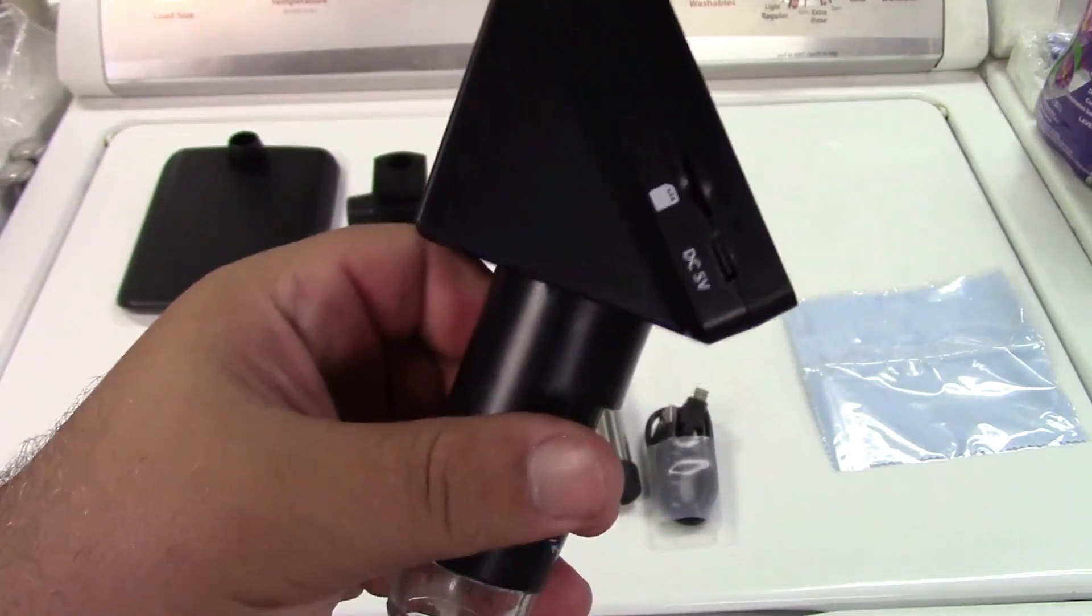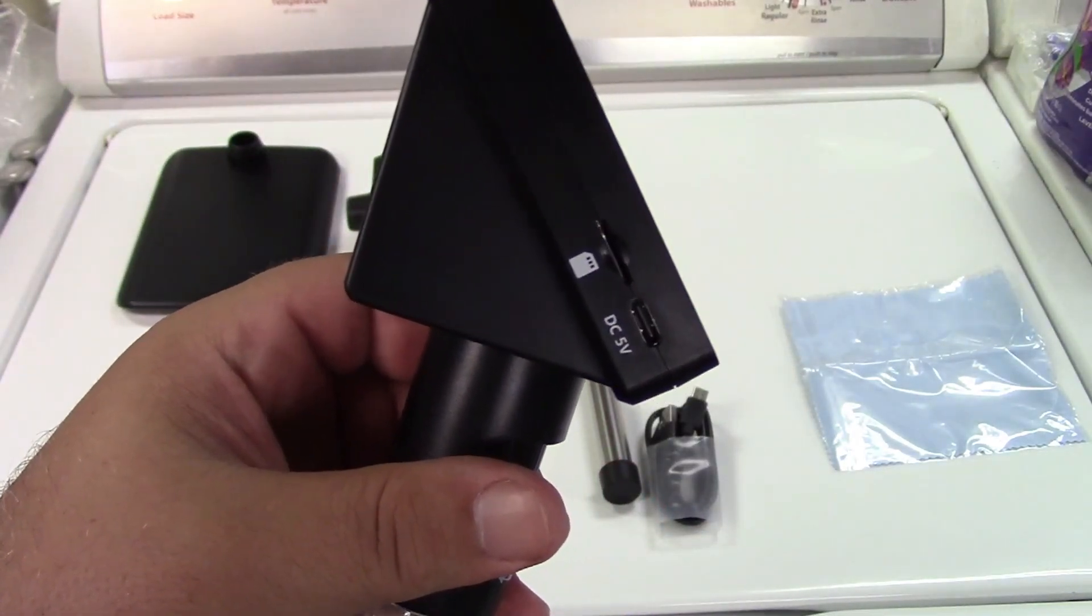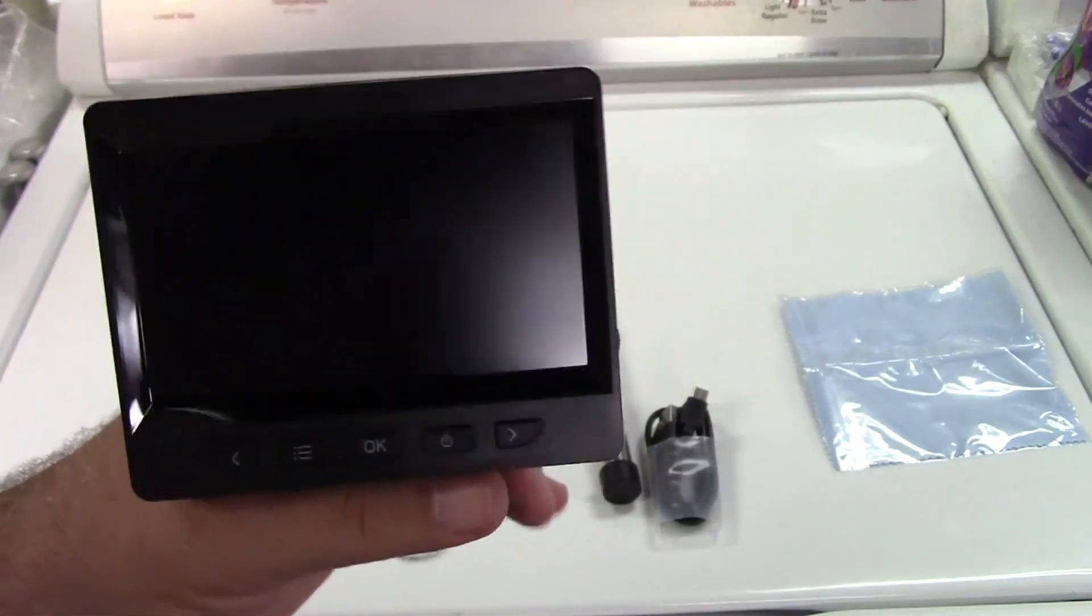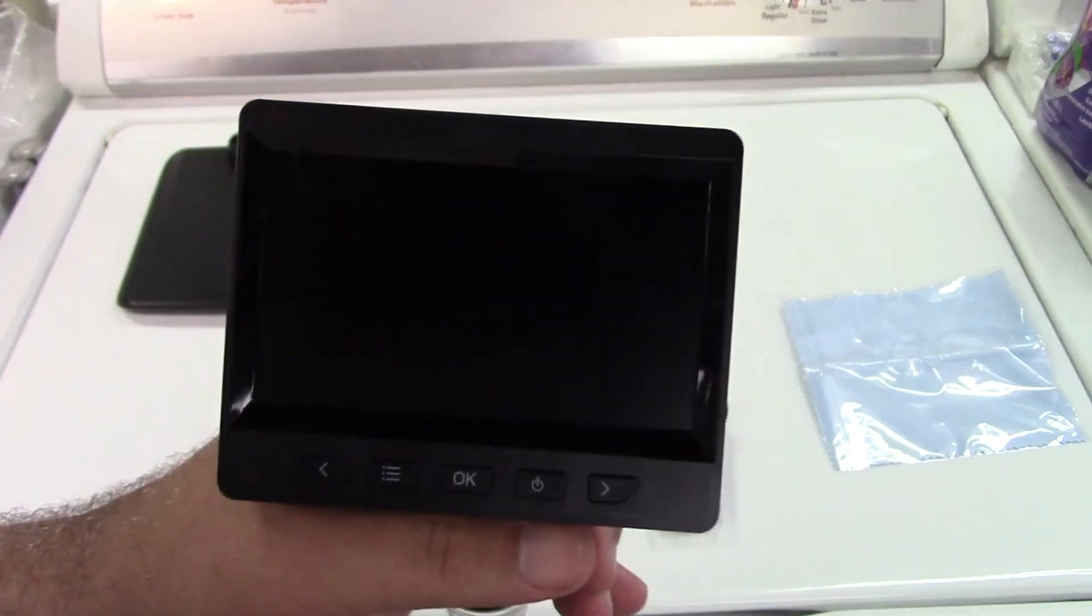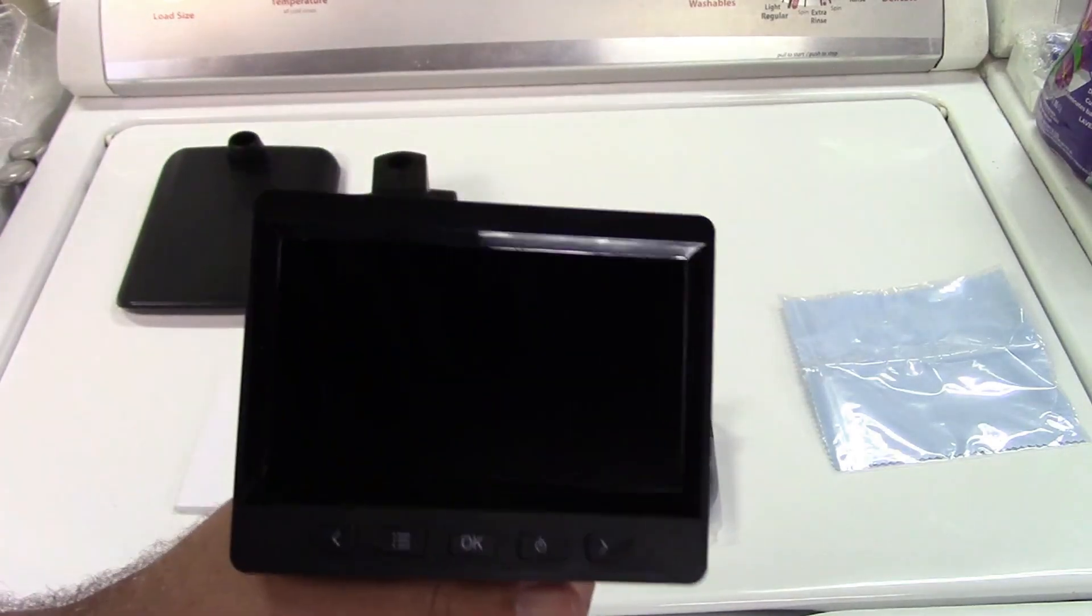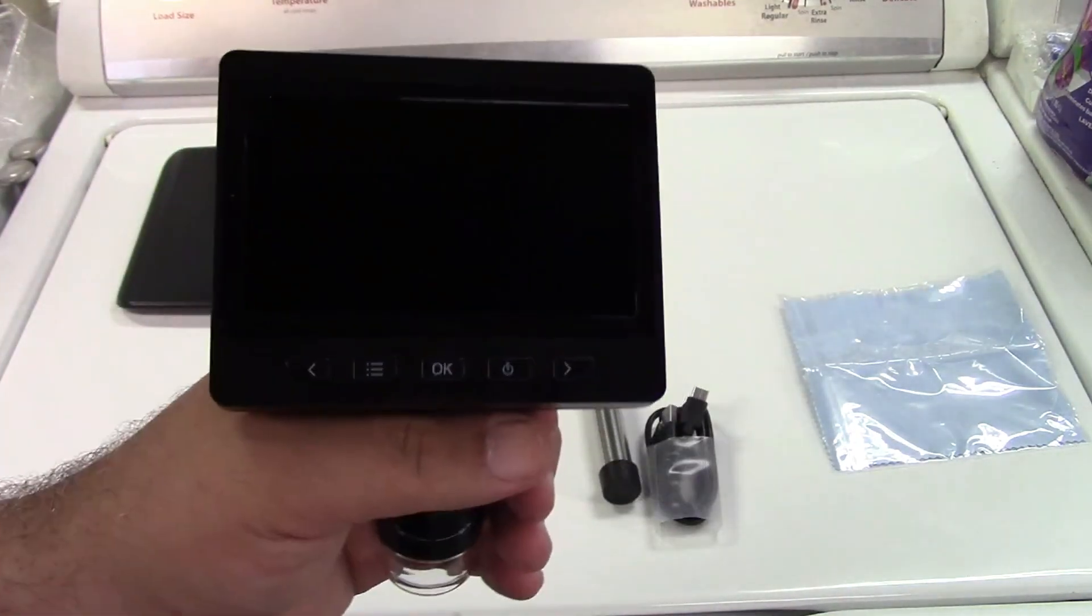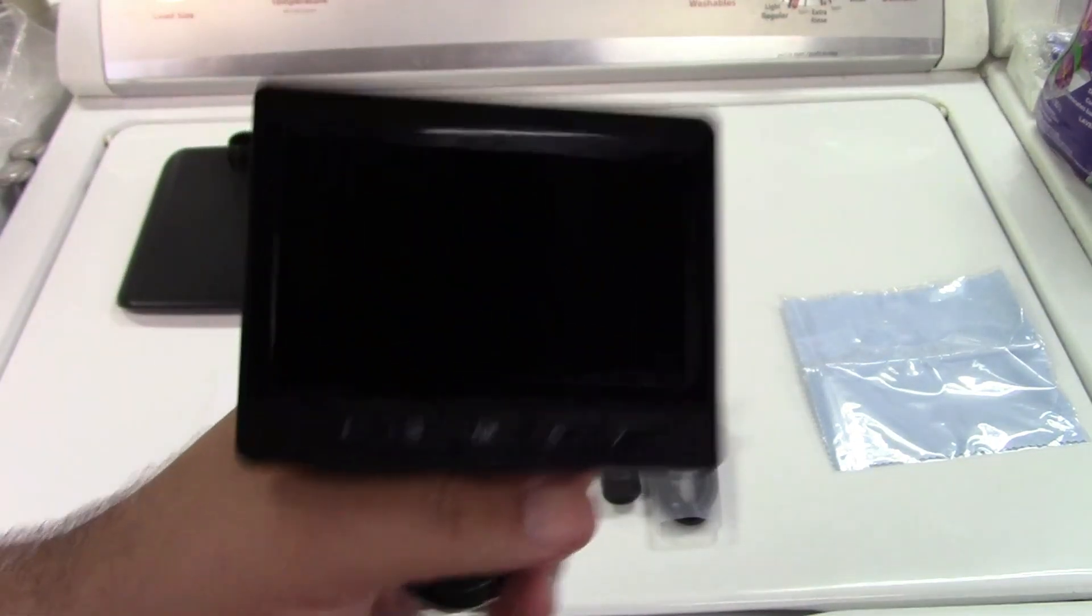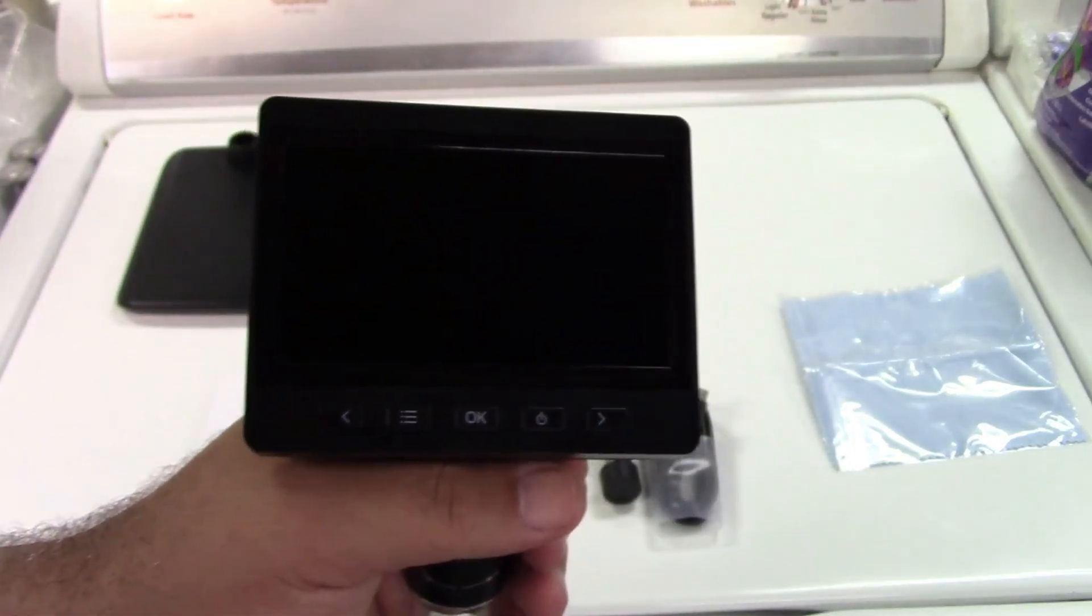However, you can put a card in there, up to 32 gigabytes, that will allow you to take up until the card's full, pictures and videos. How many is that? However many fit. I don't know. A lot more than 100, I'll tell you that much.